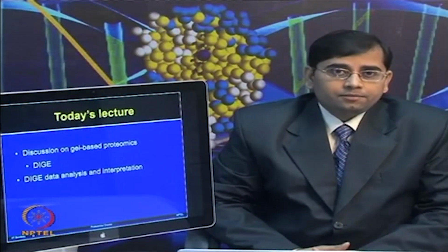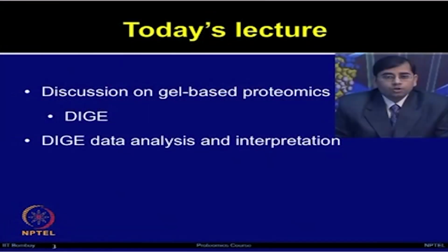So, in today's lecture, we will continue our discussion on gel-based proteomics, the certain advantages and challenges of performing DIGE experiments, how to analyze DIGE data by using a few very specialized software, and how to interpret that data, how to obtain some meaningful biological information from those analyses.